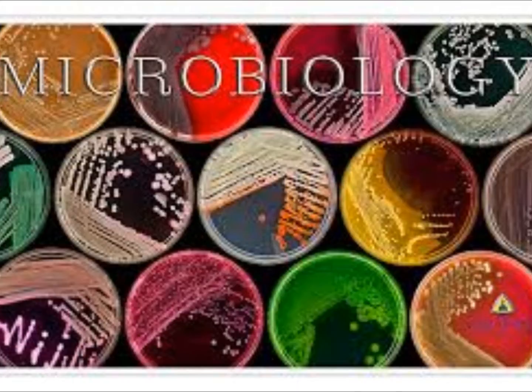We have to hand the organisms out. Do you want to keep the organisms in numerical order? Yeah, let's do that. We'll end with 7 back here, because one can do 6 and one can do 7. So we have Staph on here twice. Number 1 would be Klebsiella pneumoniae. Then Klebsiella, Pseudomonas, and E. coli on those 3.